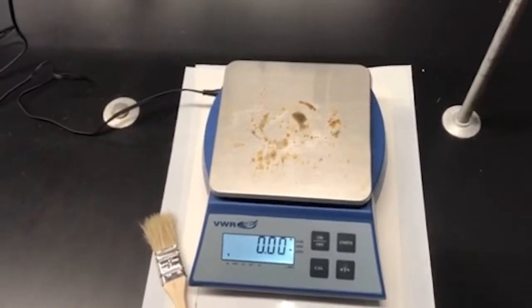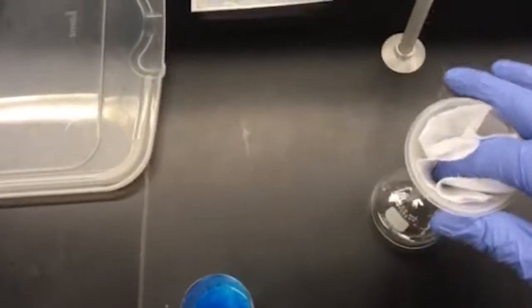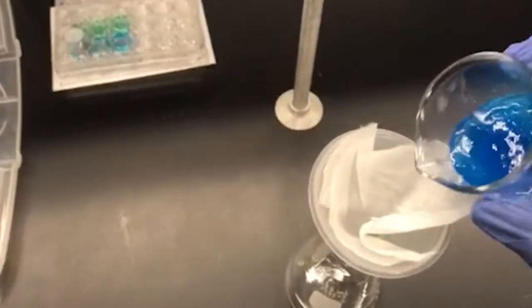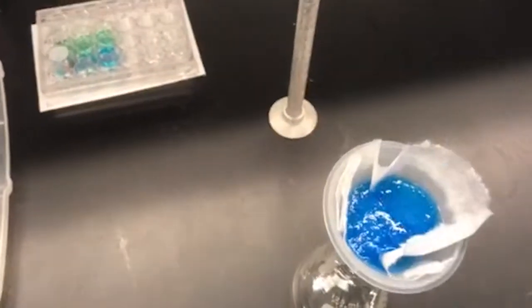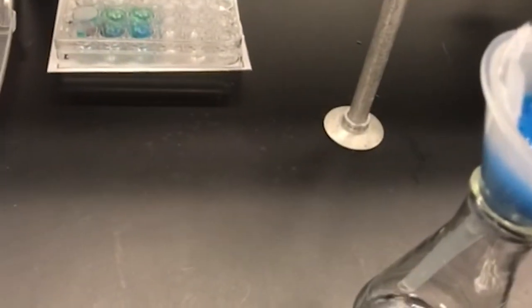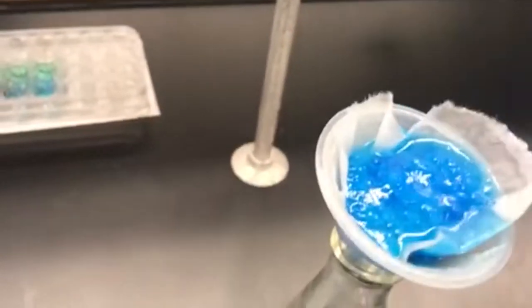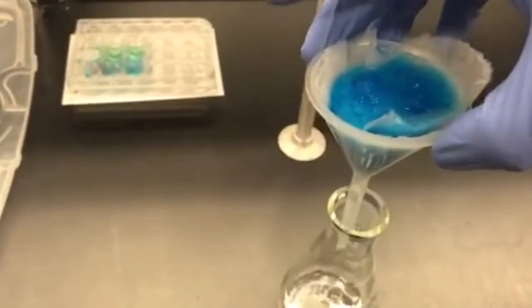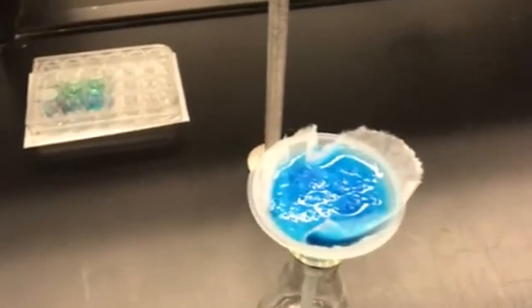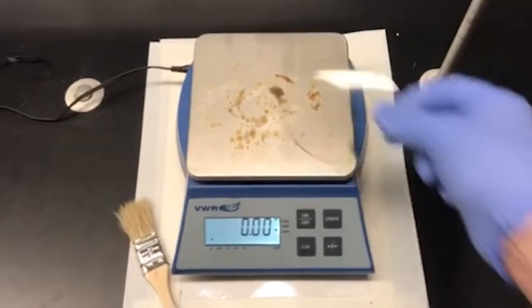What's the mass of our coffee filter? What's the mass of our watch glass?